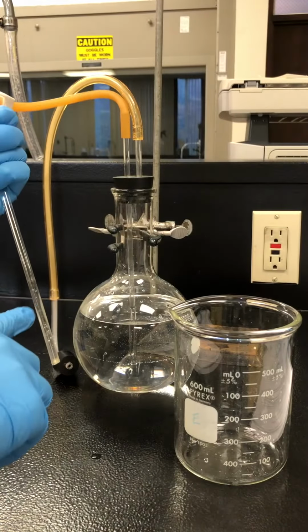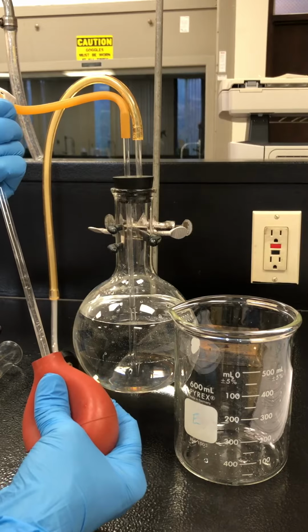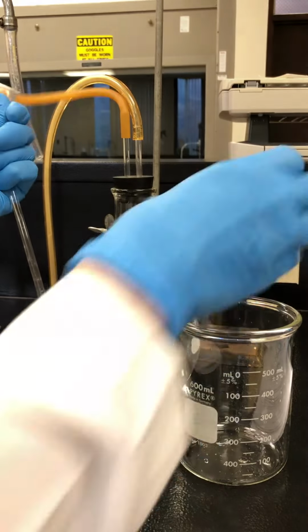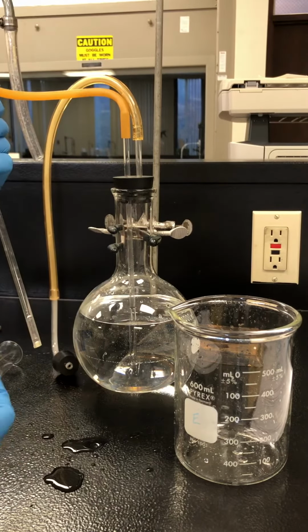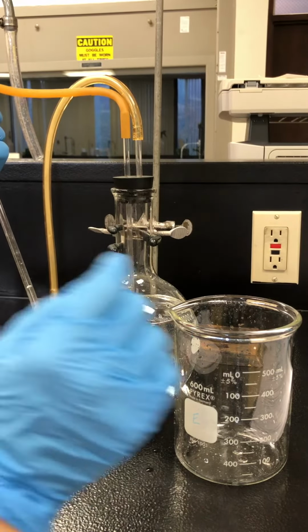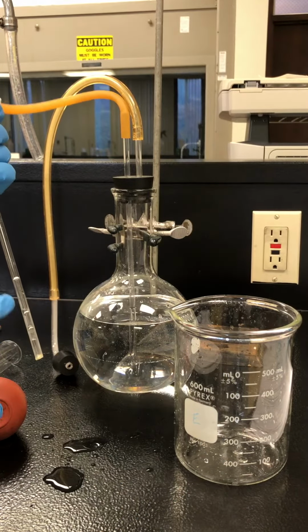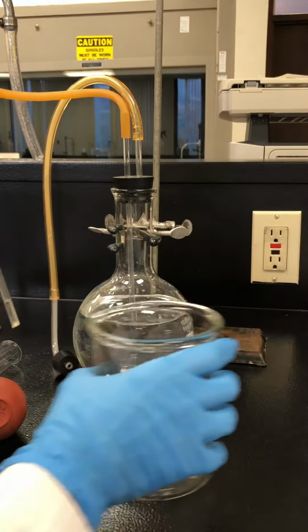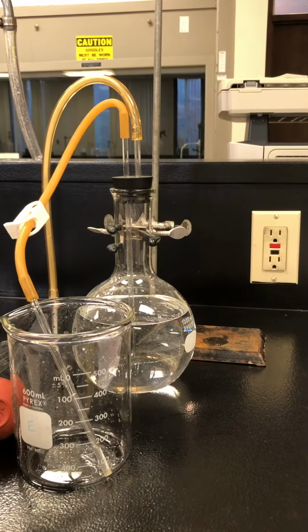I see a few little bubbles in here, but I'm going to try to draw this some more just to make sure there's no more bubbles. Good. So now I have it pinched with just my hand right now, so now I'm going to pinch it with the actual clamp. And so when I let go, there may be a few little air bubbles here at the bottom, but the whole system right now has no air bubbles in it at all.